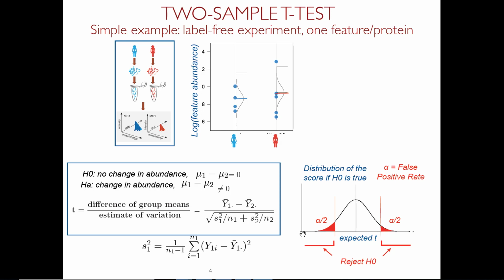So if there are recommendations to choose the threshold, pick one. My recommendation is not to choose it after you see the data. Choose it before you see the data, but it really doesn't matter. In fact, it's just enough to rank proteins by the adjusted p-value, because in many applications you only have the money to follow up on the top 10 anyway, so it doesn't matter what your FDR cutoff is, right? But if you have to have a cutoff, just pick it before you start actually analyzing the data.